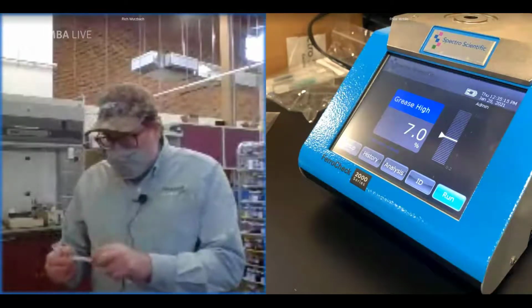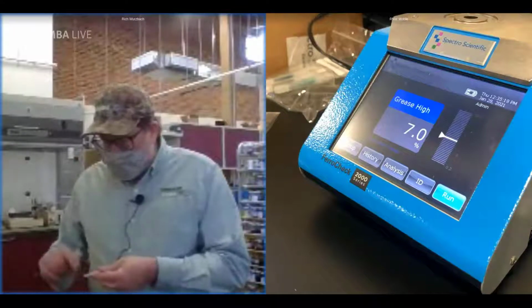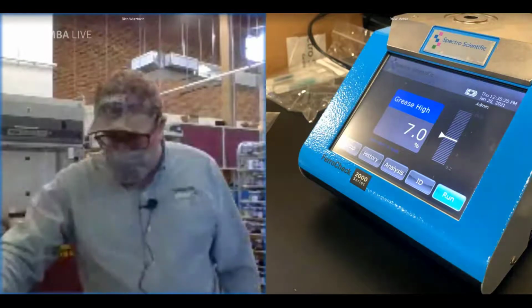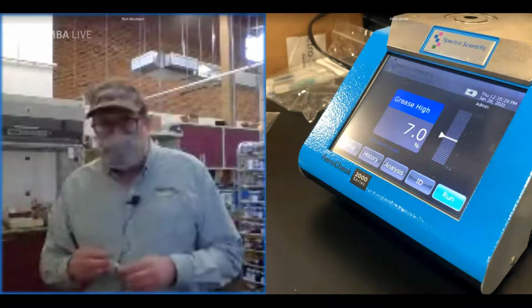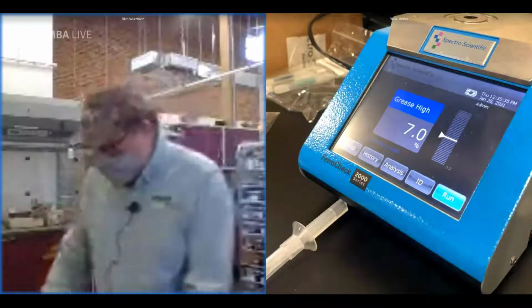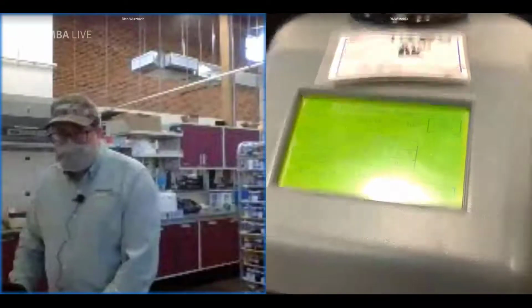and it has a little cutout like a canoe there. And the idea is that you're going to put the grease in there, fill that up, drop that into this piece, and then that gets dropped into the sample. In a minute, I'll come back and I'll demonstrate that process for us. But I'm going to move on now to another device. And this device is the FDM.